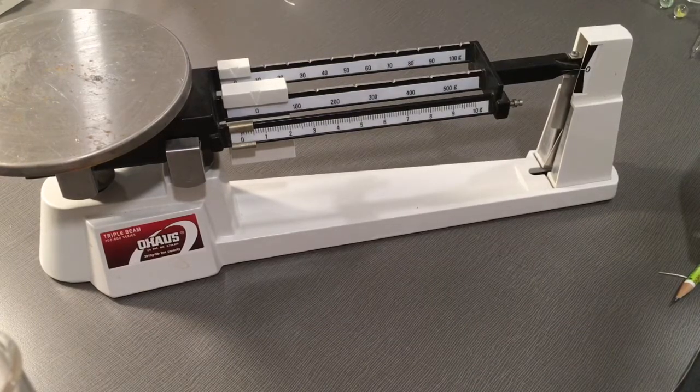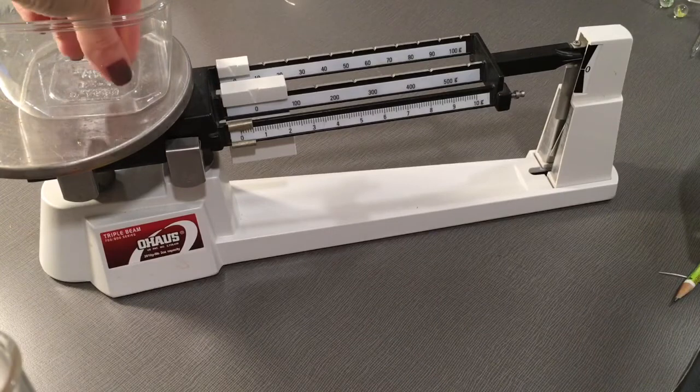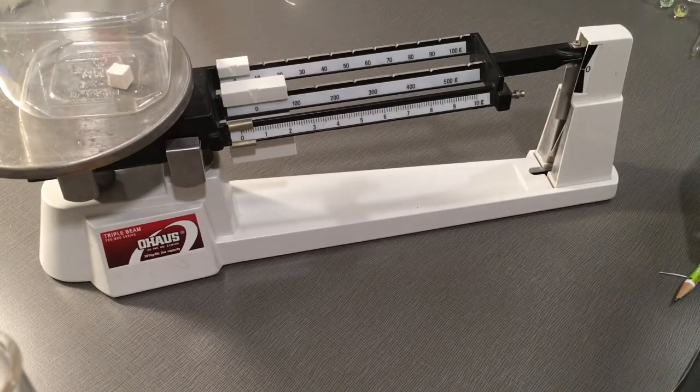When you are ready, get your weighing pan. You can put that on your triple beam balance. Remember to find that mass before you add any objects to the pan.